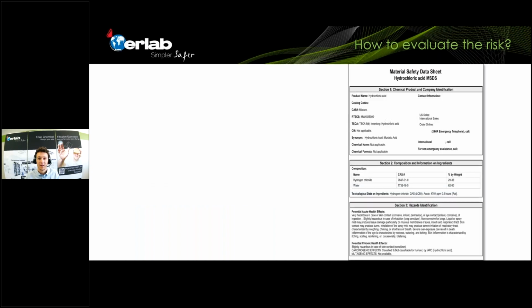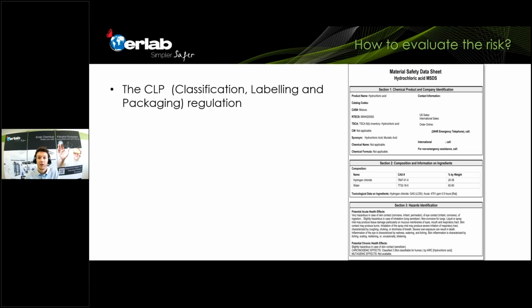Next to the exposure limit values, there is another aspect that we can use in order to know if a product is dangerous, or what the identity is of a chemical product that you're exposed to.